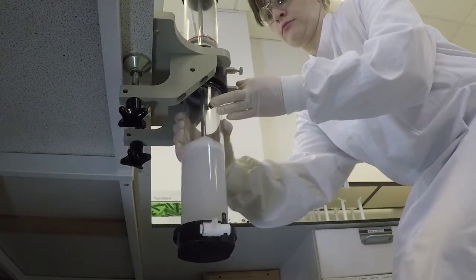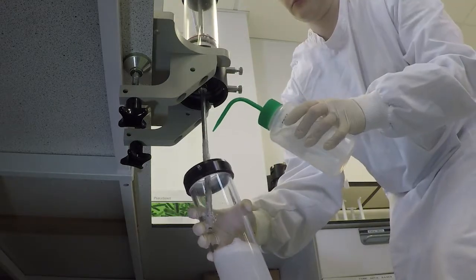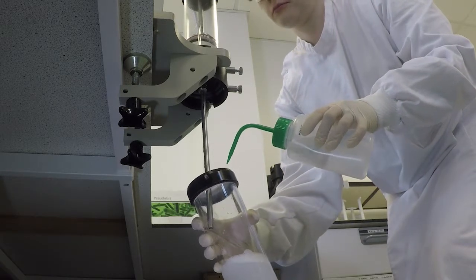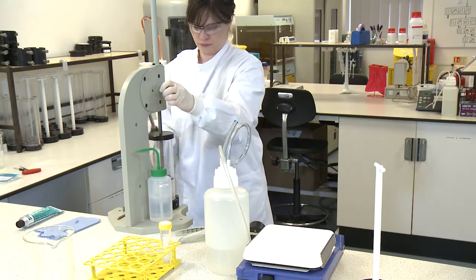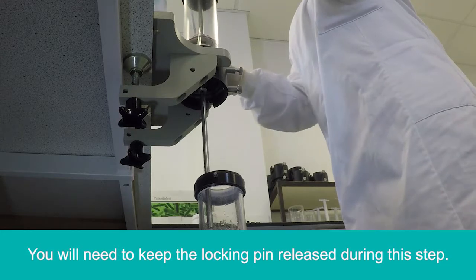Detach the assembled concentrator tube and hold it directly below the steel tube. Rinse the steel tube with PBST. Expel the remaining liquid from the elution tube by compressing the foam 5 times.